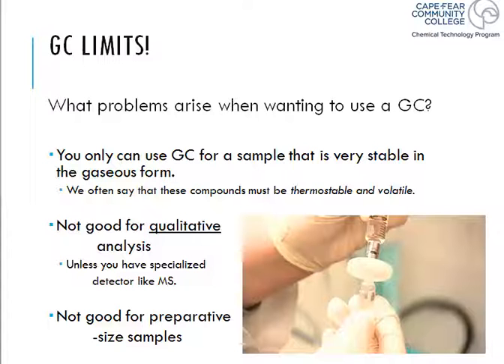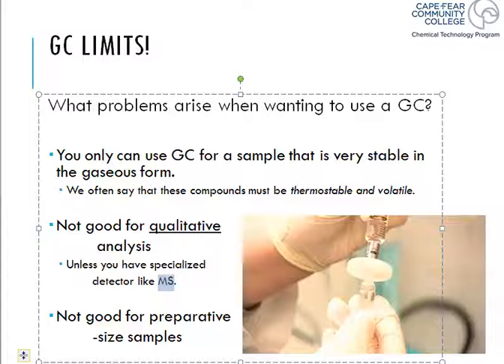And qualitative analysis is very difficult sometimes on gas chromatography unless you have a mass spectrometer. Now, our laboratory does have a mass spectrometer. You will get to use a mass spectrometer if you're in our program, but if you're part of the competition, you might see the mass spectrometer in the lab, but you probably aren't using it. If you're one of the lucky teams, you might be. But that's what we call the Ferrari of our laboratory, as it's typically the most expensive piece of equipment that we have. Okay, so this is where I'll stop.